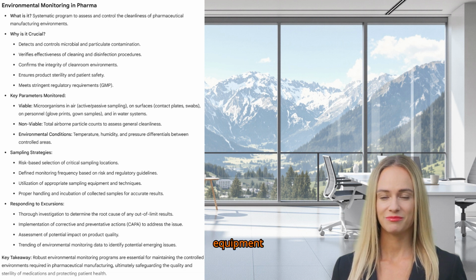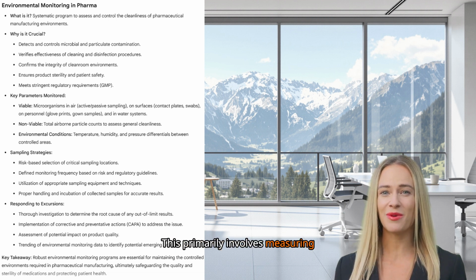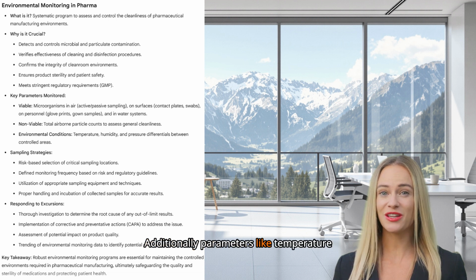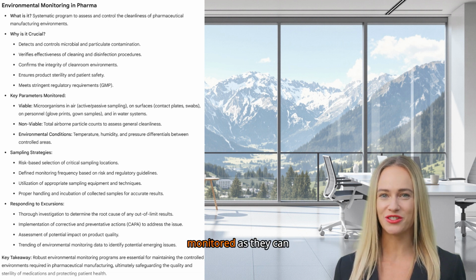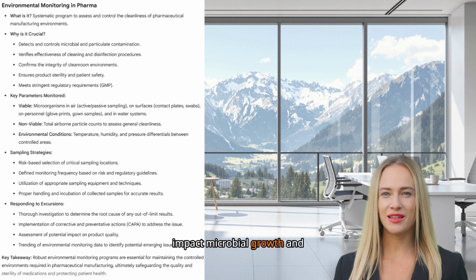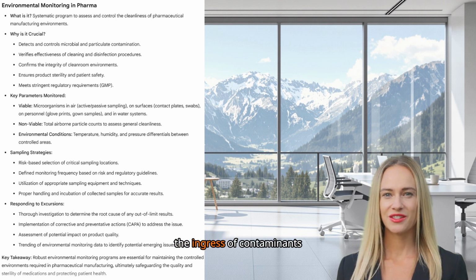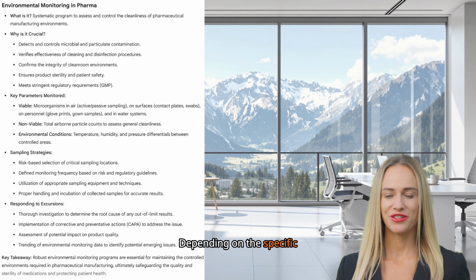Personnel monitoring is also essential, typically involving taking glove prints of personnel after critical manipulations and sampling their gowns. In some cases, water sampling might also be required, especially if water comes into contact with the product or critical equipment. Alongside viable monitoring, non-viable monitoring is also important. This primarily involves measuring total particle counts in the air to assess the overall cleanliness level. Additionally, parameters like temperature and humidity are often monitored as they can impact microbial growth and the stability of certain products. Pressure differentials between different cleanroom zones are also tracked to ensure the intended airflow and prevent the ingress of contaminants. Depending on the specific manufacturing process, other parameters might also be monitored.